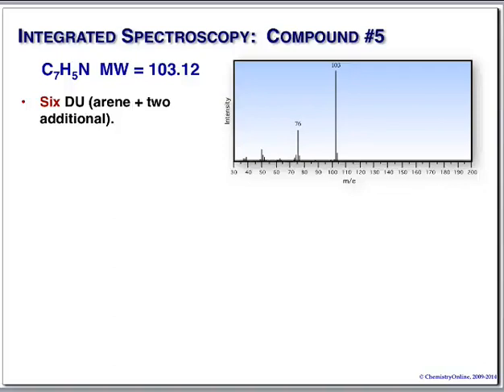Gee, what I would look at this and say is, I know I have a benzene ring here, and because I don't see a peak at 91, I don't have a benzyl group. If we had a benzyl group, we would have a peak at 91. So nice negative information here. M-27, I don't know what it is. But we don't have a benzyl.